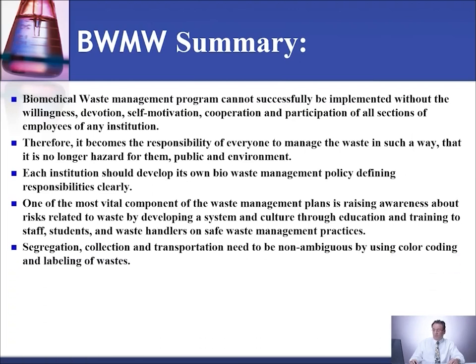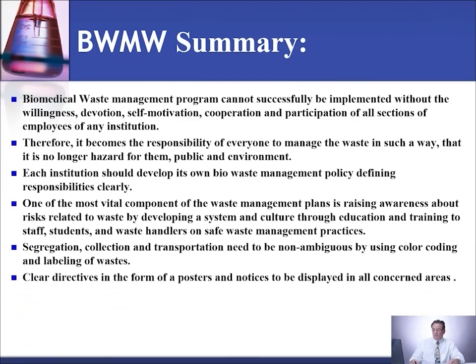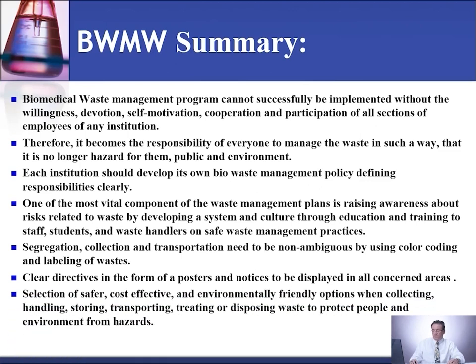Segregation, collection, and transportation need to be unambiguous by using color coding and labeling of wastes. Clear directives in the form of posters or notes should be displayed in all concerned areas. Select safer, cost-effective, and environmentally friendly options when collecting, handling, storing, transporting, treating, or disposing of waste to protect people and environment from hazards.